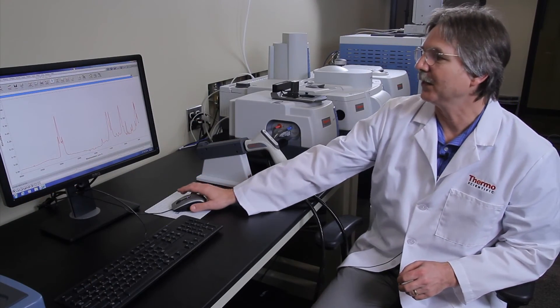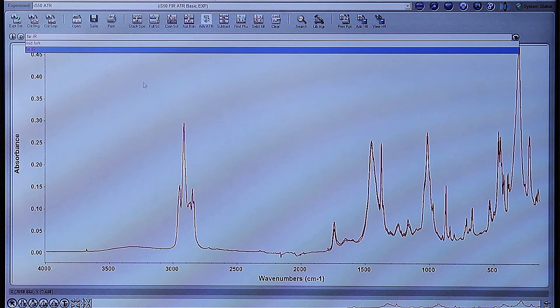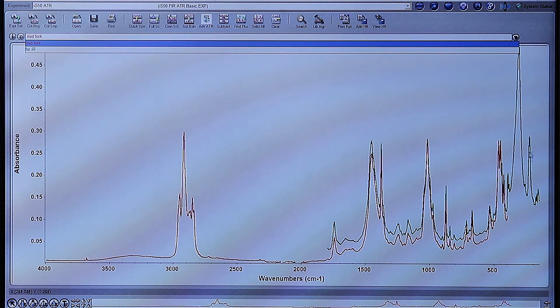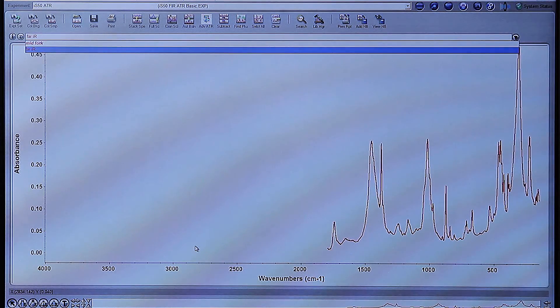Here we see the mid-infrared spectrum again, but what we've done is collected the far-infrared to fill in the areas that the mid-infrared spectrum hasn't shown. The green spectrum shown here has extra peaks that you would not be able to see if you just did mid-infrared. Removing the mid-infrared, you can see the entire far-infrared spectrum down to about 150 wavenumbers. The goals for today were to collect mid-infrared spectra using the IS-50 ATR as well as collect far-infrared spectra using the same accessory. Thank you.